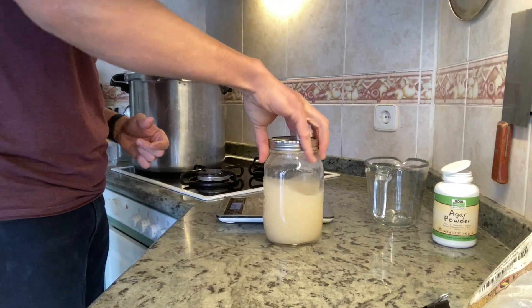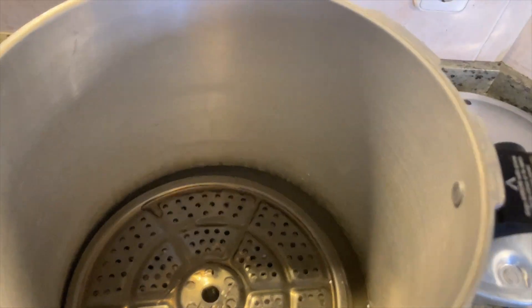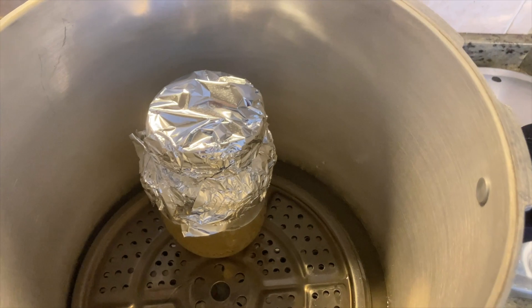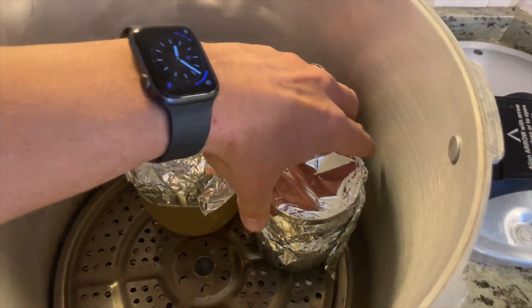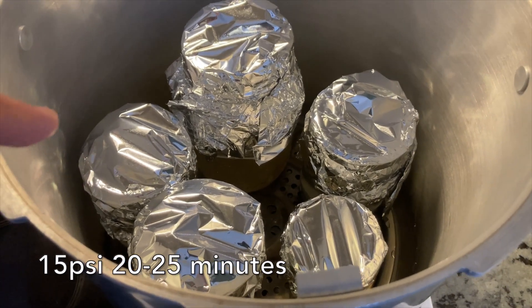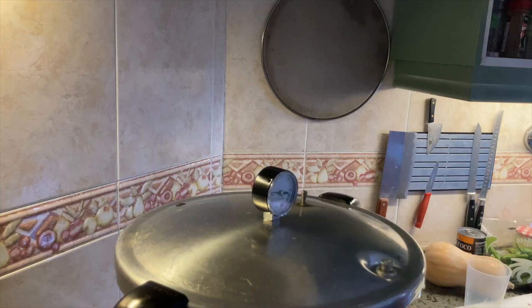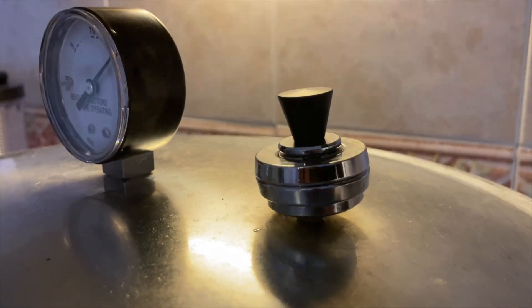I've got a Presto 23-quart pressure canner and I've already put four quarts of water in here. You don't want your stuff sitting in water — you want it to be steam-sterilized. I've put tin foil on top of all of these to keep water from going inside through the filters and getting the filters wet. We're going to cook this at 15 PSI for 20 minutes. We'll wait until it vents out for 10 full minutes, then put the weight on, bring it up to pressure, and that's when our timer starts.